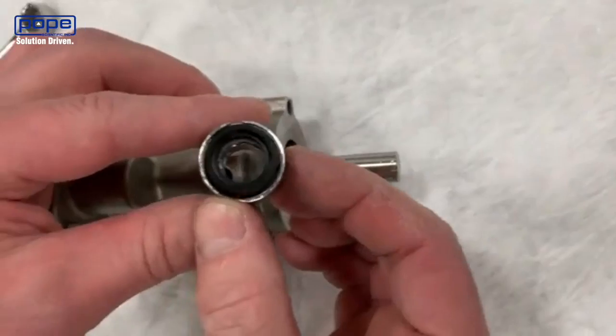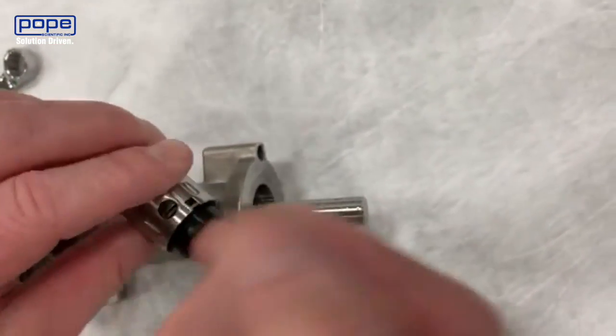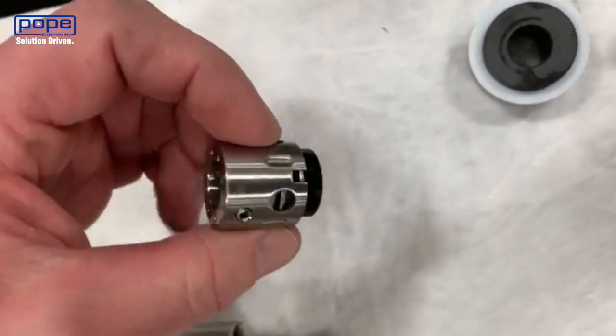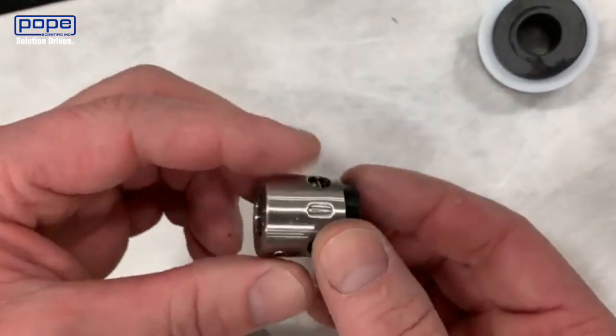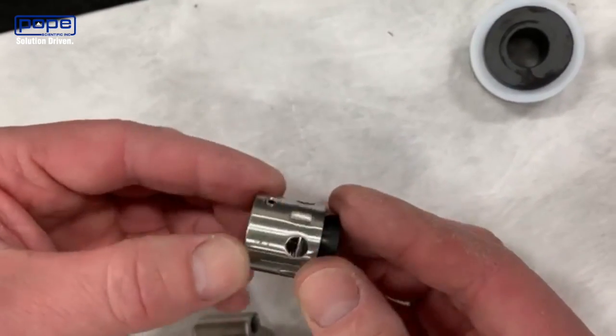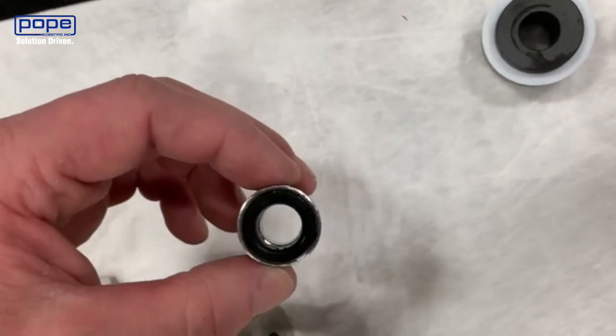If you look at the mechanical seal, there's Teflon inside — that's what we're looking not to scratch with any burrs on the shaft. You'll also see set screws on both sides. You want to make sure those are nice and loose so that they don't scratch the shaft as you pull that mechanical seal off.